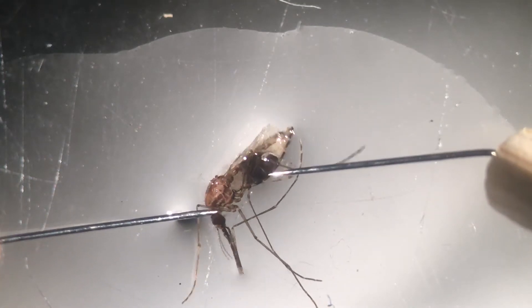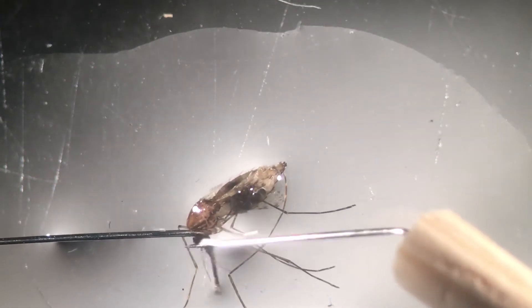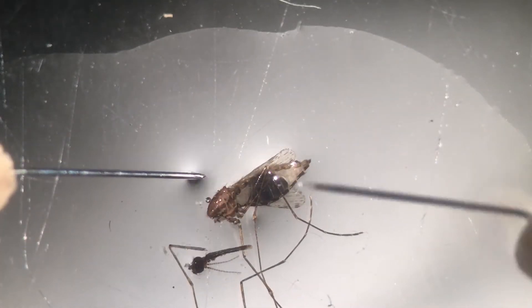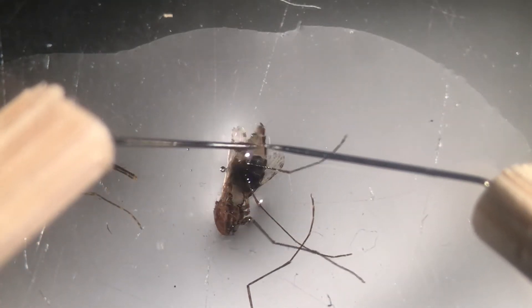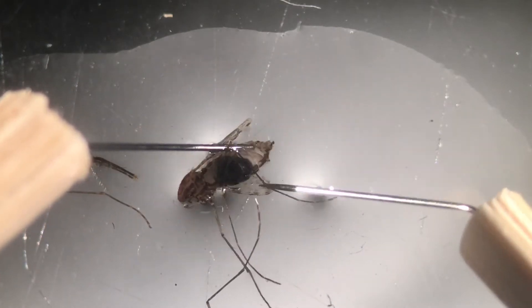Head first - that's not very difficult. There we go, that's the head been cut. Let's put the head to one side and then we're going to cut the last two segments here.